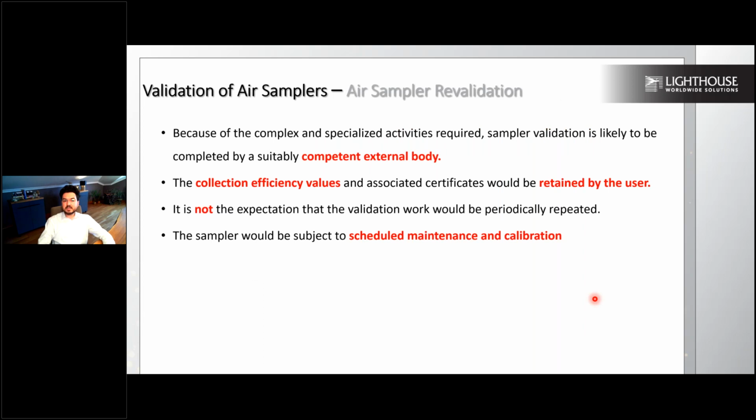Because of the complex and specialized activity required, sampler validation is likely to be completed by a suitably competent external body, which will be under the responsibility of the manufacturer of active air samplers. The collection efficiency value and associated certificates should be retained by the user.